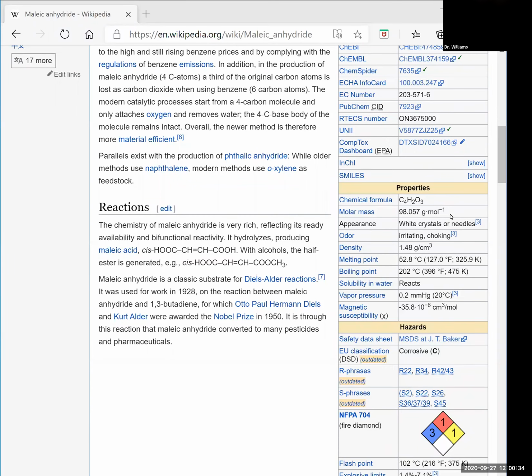This is a short description on how to use an automated melting point apparatus. The first thing you want to do before inputting any parameters is to find out the theoretical value for the melting point of your sample of interest. We do this by consulting Wikipedia, PubChem, ChemSpider, ChemDraw, any reasonably authoritative database.